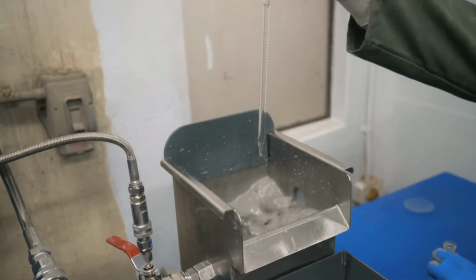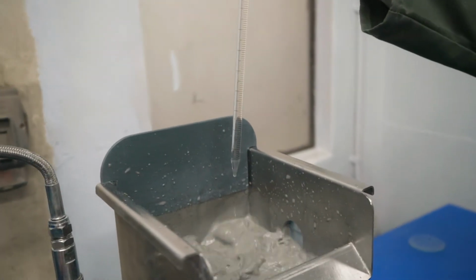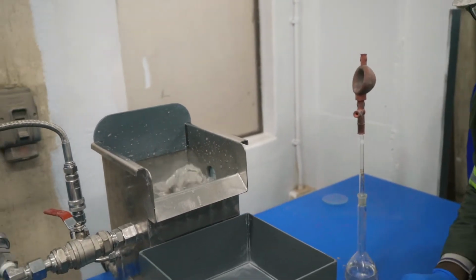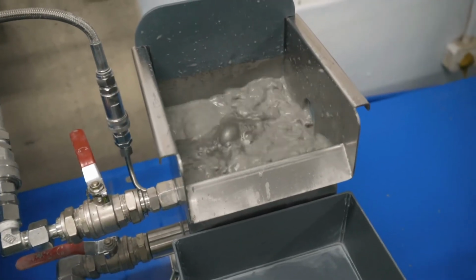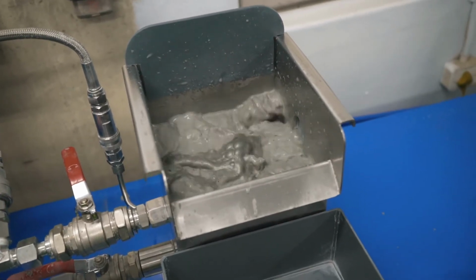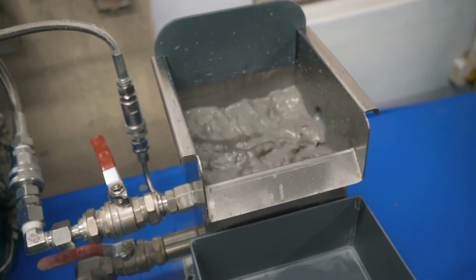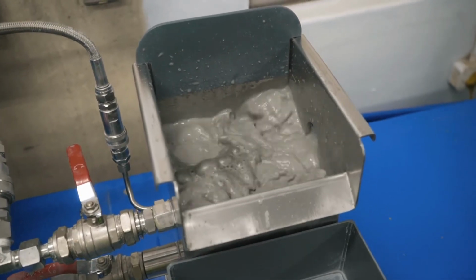So now we're putting in just a very little frother, and the reason to put the frother in is to make sure that we hold and retain some of the fine bubble that we're going to be creating with the MACH, because we don't want that all breaking up and dissipating. We're giving it a little bit of time to mix in. So now we have xanthate collector in there, and we have a little bit of frother, and it's conditioning.